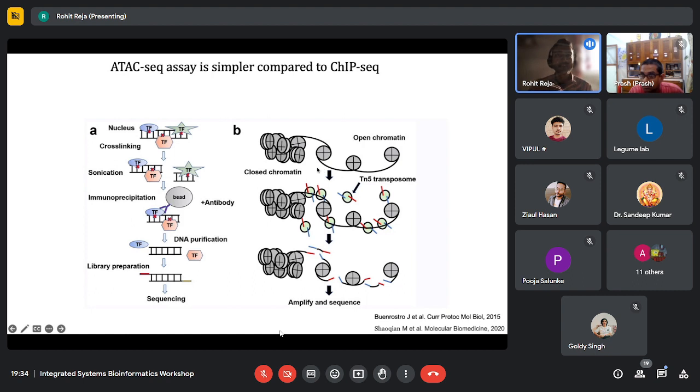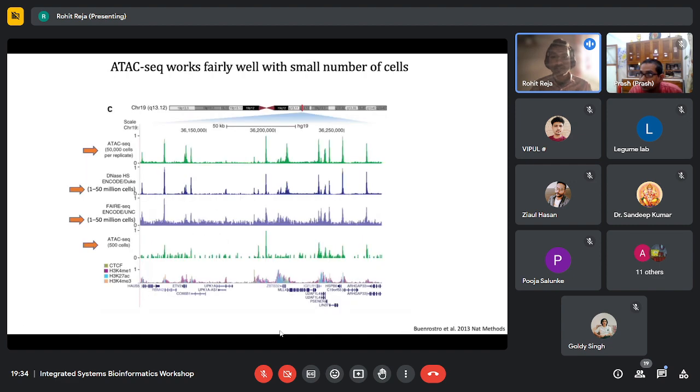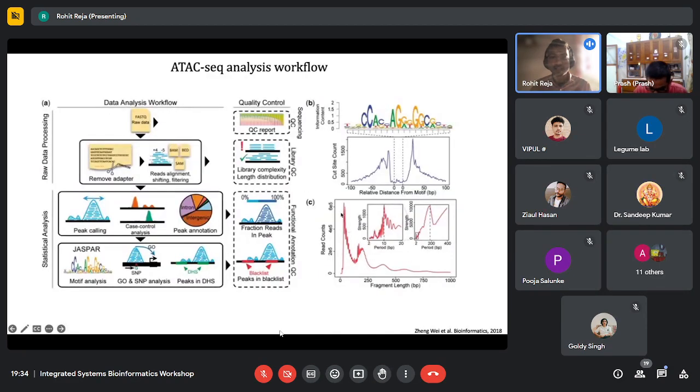So when you look at the distribution of fragment length, it should be cyclic, where you have enrichment for one nucleosome, two nucleosomes, three nucleosomes. So kind of like this, where you have a stronger enrichment, like a stronger peak for, let's say, a transcription factor, but then you get a mononucleosome, dinucleosome, trinucleosome kind of pattern. This gives you an indication that your ATAC-seq protocol actually worked, and you have a fragment length distribution that mimics what you should be expecting.